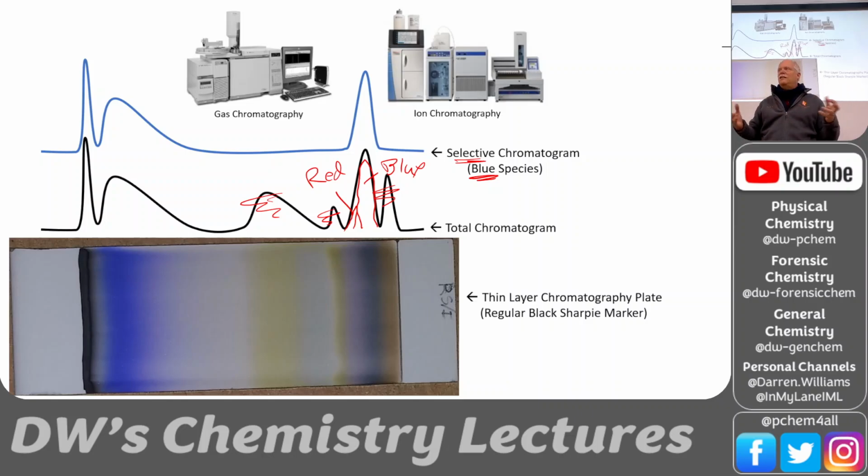There's lots of different detectors, but that thermal conductivity detector doesn't really give you that much about the identity of the gas. So it's not very selective. It's just going to give a signal. So it might give you this total chromatogram signal, but it's not selective. You put a UV vis on there, you put a mass spec, put an FTIR, then you can select the ions that you want to look at, or the molecules you want to look at.